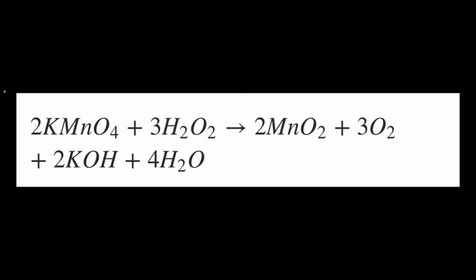Now, there's also an oxidation reaction going on here with the hydrogen peroxide. As hydrogen peroxide loses electrons, you may have seen bubbles rising in the solution. That was oxygen that was rising out of the hydrogen peroxide.